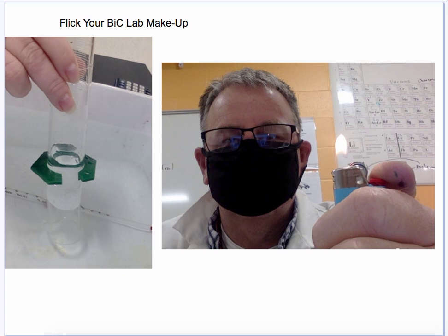Okay, this video is for the Flick Your Bic makeup lab. In this lab, we took a Bic lighter and recorded the mass before we let out any gas. What we're trying to do is find the molar mass of a gas. To get a molar mass, you need to know the grams in 1 mole, so you take the grams divided by the moles.